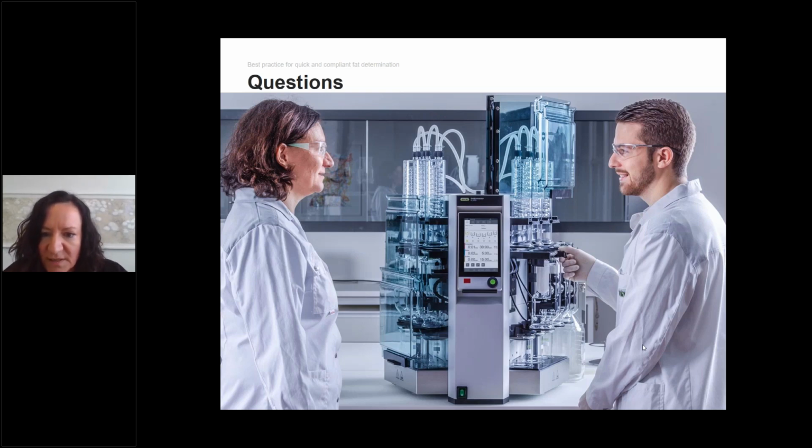There is another question: how many times can you reuse the solvent? Actually, we say normally about 5 times, but in reality, there is always one portion of solvent that is soaked up by the sample. And this portion needs to be replaced by fresh solvent. So that's why we always have a mixture of fresh and old used solvent. So there's not a real recommendation that after 5 times the extraction is not good anymore.